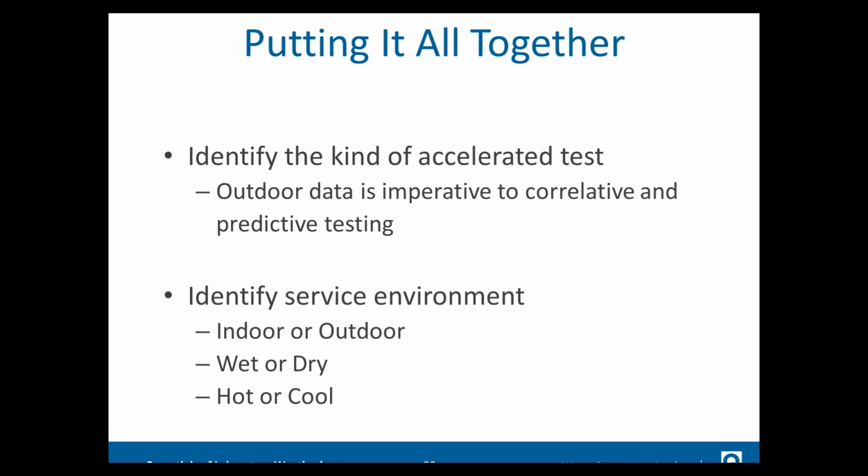Testing at benchmark sites is not expensive. A lot of people are often concerned about that, but depending on the size of your specimens and the rate of the test, you could be talking about less than $10 per year per specimen. So keep that in mind. Identify the service environment: is your material going to be installed indoors or outdoors?